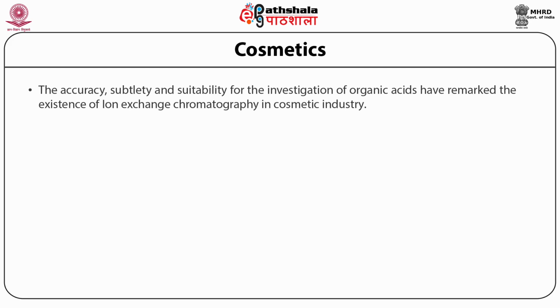cosmetics. The accuracy, subtlety, and suitability for the investigation of organic acids have marked the existence of ion exchange chromatography in the cosmetic industry.